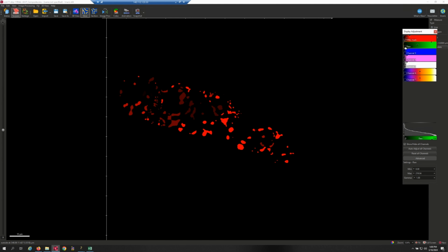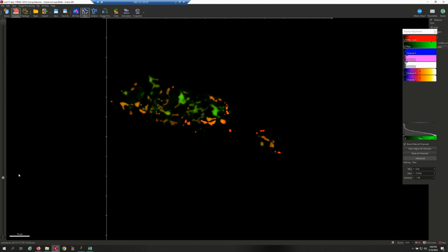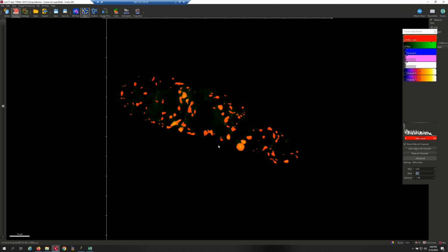After reopening the raw file, you can check the mask you just created to see if it corresponds, whether it matches the raw image. Sometimes, if it's too faint you might not see it. You can enter one here, and it will fill all with the same color, so you can see it clearly. Now, the mitochondria that we just marked based on the threshold are already connected here. Alright, the solid parts have also been filled in. Okay, who's next to check?